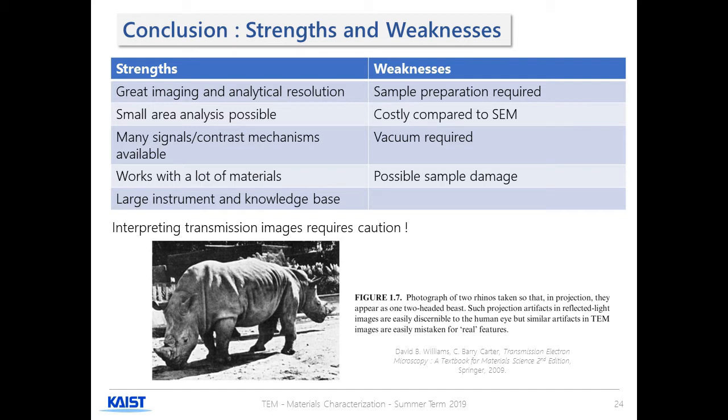Finally, a word of caution. While TEM images might be impressive, they must be handled cautiously, while keeping physical context and principles in mind.